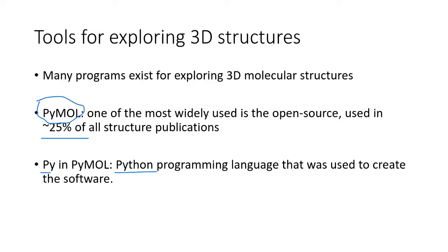You will need our manual, and maybe you will have to watch an instructional video on a different protein, on how PyMol looks and what commands can be used in PyMol. But your tutorial will take you through the steps the same way it did with MEGA. You should be able to complete it just with the tutorial without the video, but please go ahead and watch the video if you're not very good with computers and software. This is a very classical software, and it's used in pretty much any lab that works with proteins.